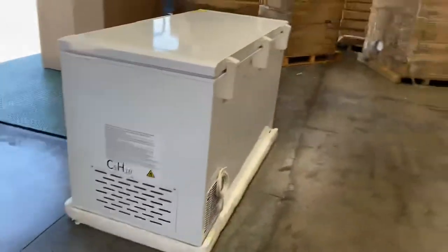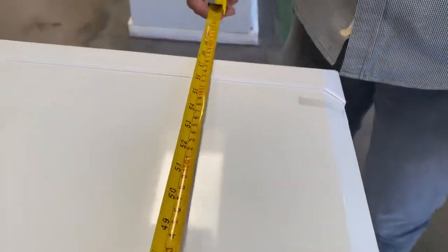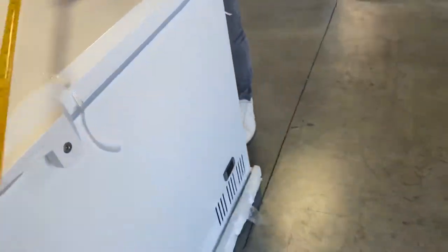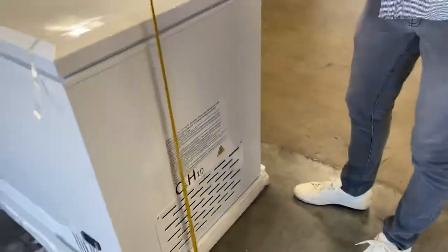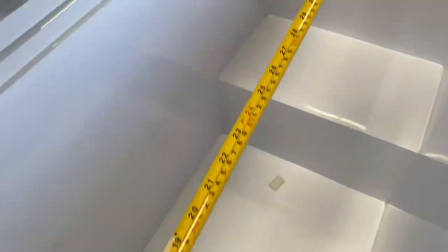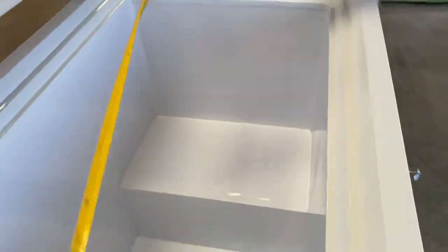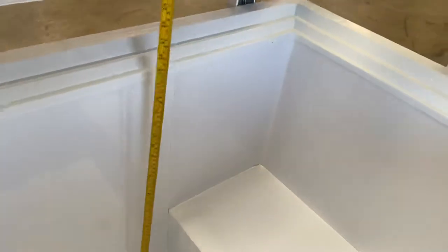On to our last model, our biggest size available. You're going to be looking at a measurement of 59 inches of the length, followed by a depth of 28, and the overall height is 35 inches. Casters included, lock for the door, basket also included on the inside for this unit. Inside measurements: you're looking at 51 inches of the length, followed by 19 inches of the depth, and 25 front top to bottom.